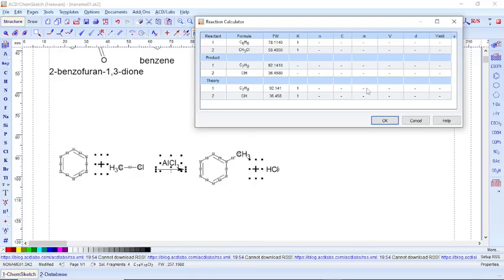What mass of the toluene do you need? Maybe I want to have 6.5 gram as my theoretical product. I will click outside. It will estimate everything: for me to produce 6.5 gram of the toluene, it will also produce 2.5719 gram of hydrogen chloride.